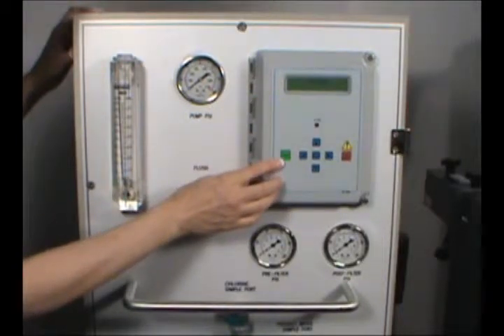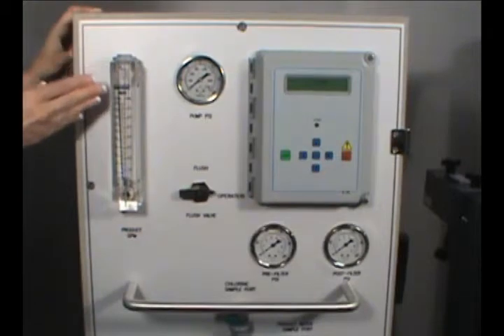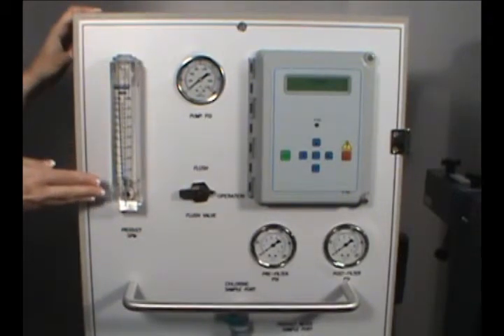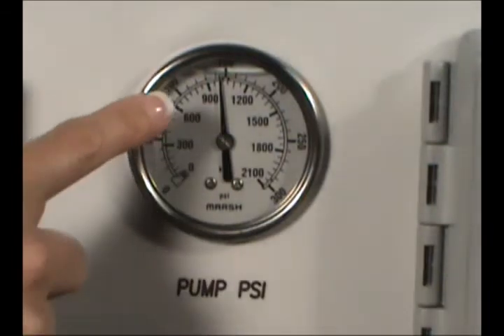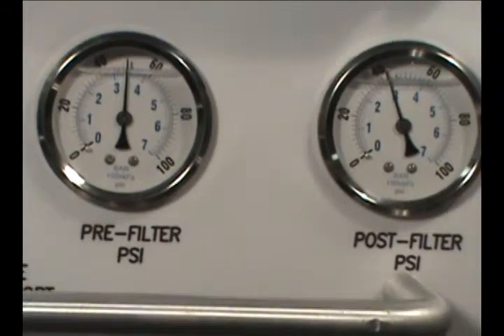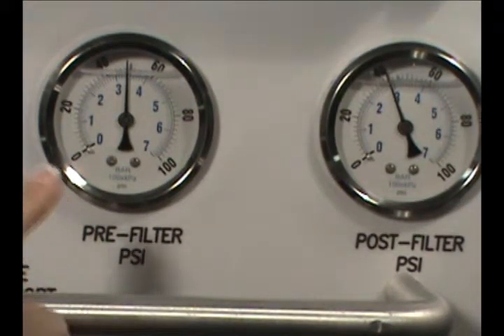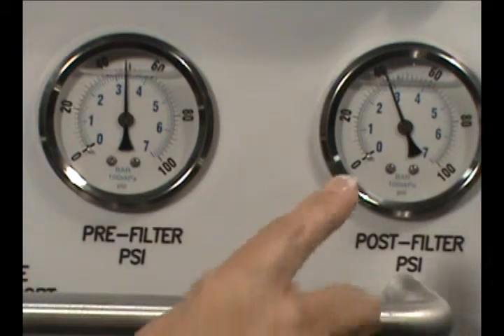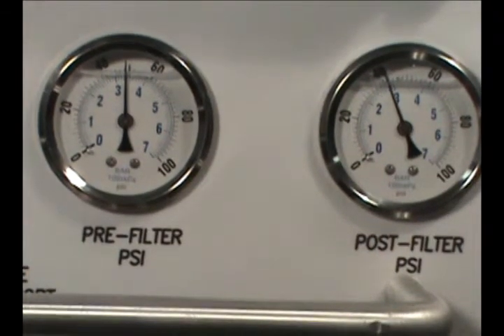The controller also has a green on-off key and a red alarm silence and reset key. The product flow meter indicates the flow rate of the product water. The pump pressure gauge pressurizes the membranes to make them function properly. The pre- and post-pressure gauges measure the inlet and outlet of the sediment and carbon filters, with the difference between gauges indicating when filters are becoming clogged by showing a differential pressure.